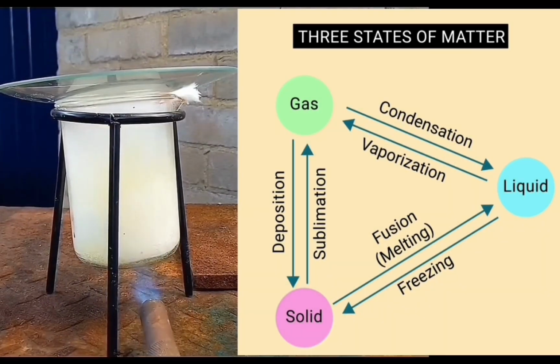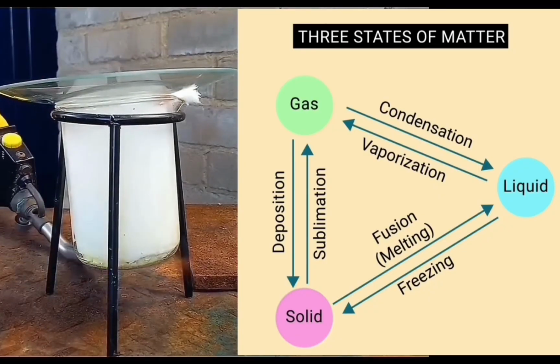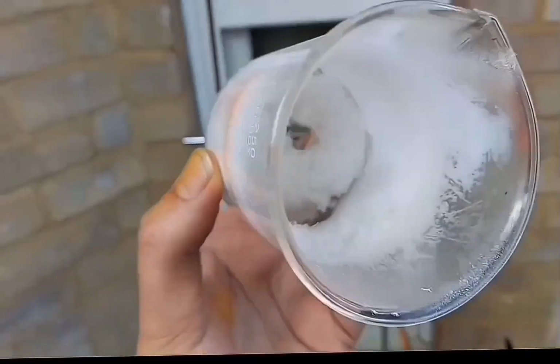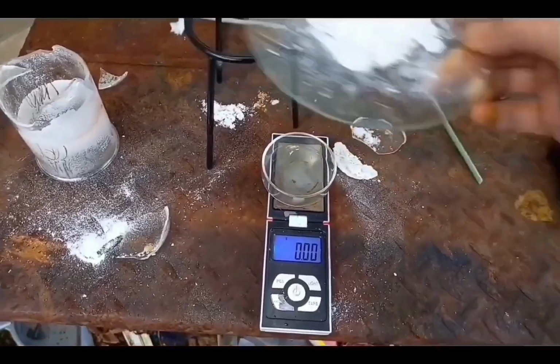Heat causes sublimation and your product crystallizes on a cold surface. My beaker cracked due to thermal shock. Even heating is much better. This was good enough for my purposes, but don't follow this as an example. I was able to recover what looks like some pure product. At least it hasn't reduced back to selenium.